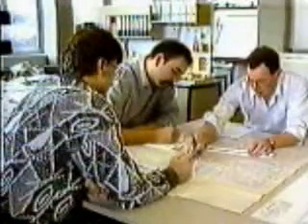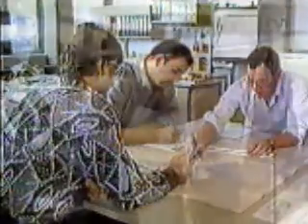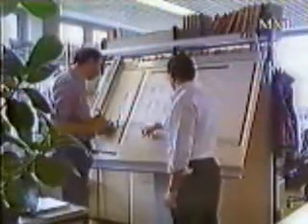This program is designed to be a visual dictionary to help with the planning of work areas in cleanrooms. It was filmed on location in one of the research and development cleanrooms of the company Meissner and Wurst, who build cleanrooms and other high-tech facilities worldwide.